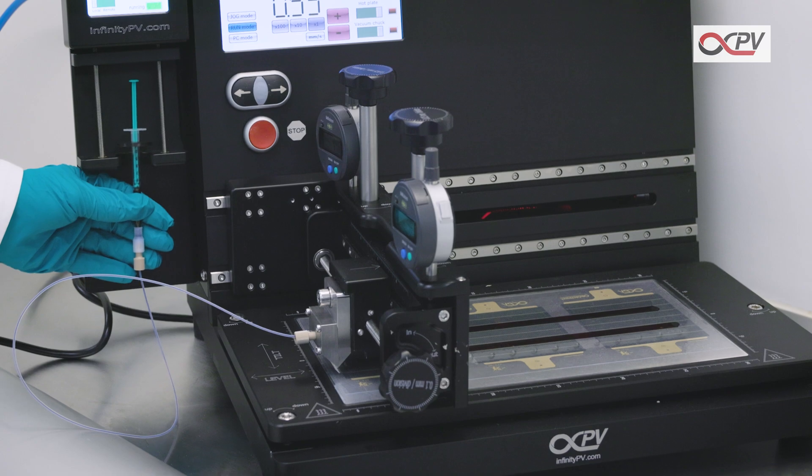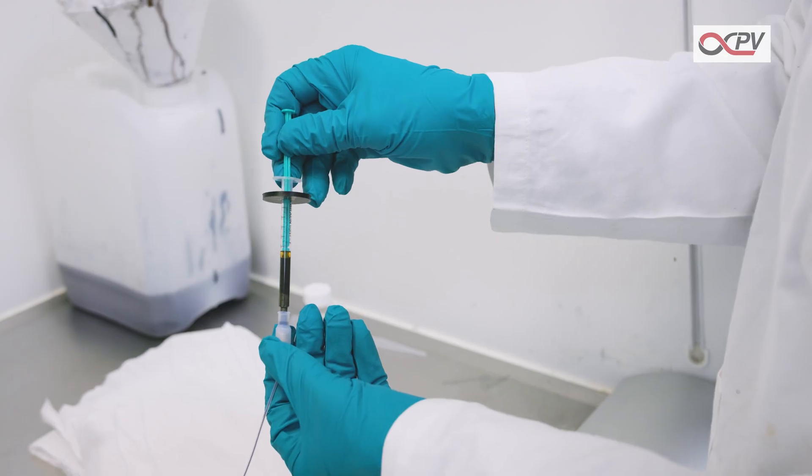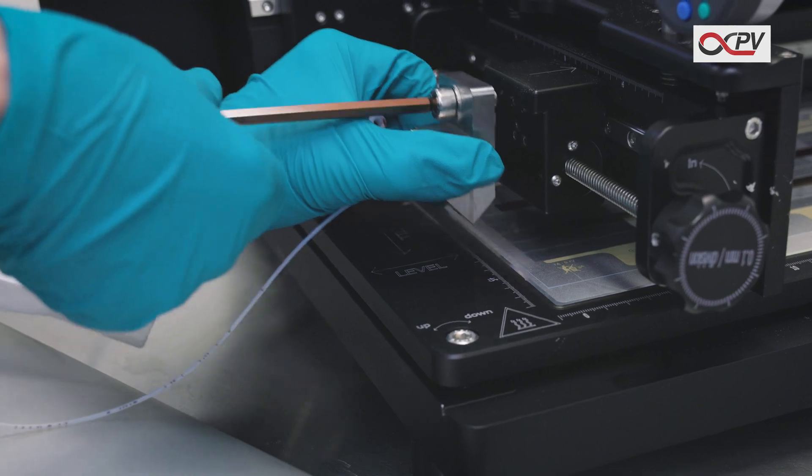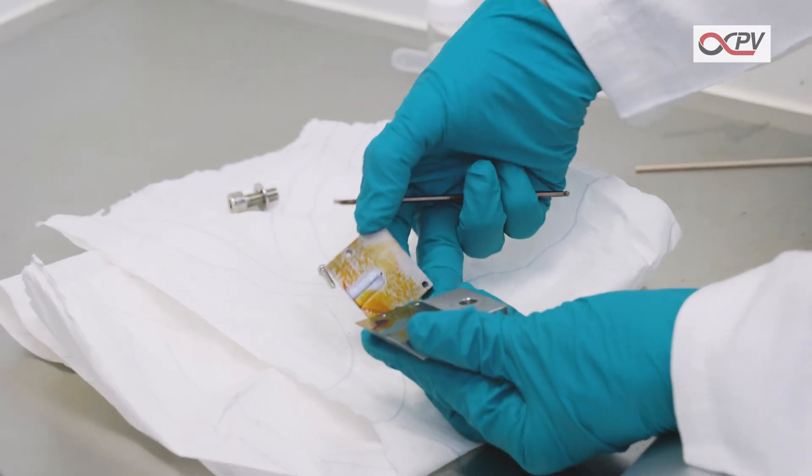Once the second stripe is done, detach the syringe and subtract the ink residue from the Slot Dye Head. Detach the Slot Dye Head, disassemble it, and clean it.